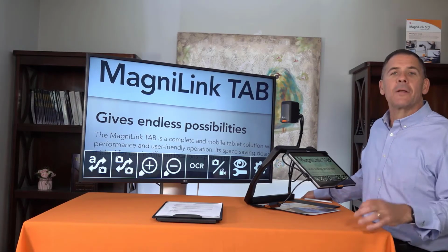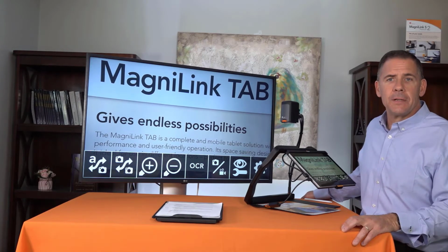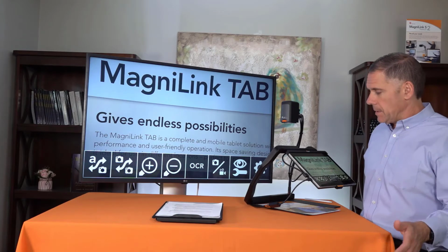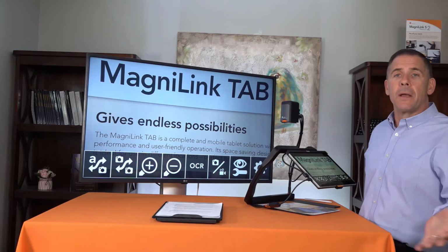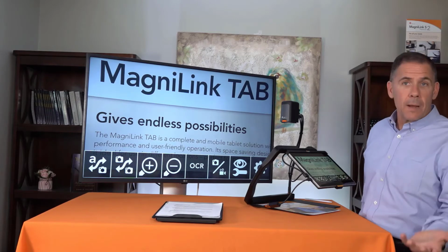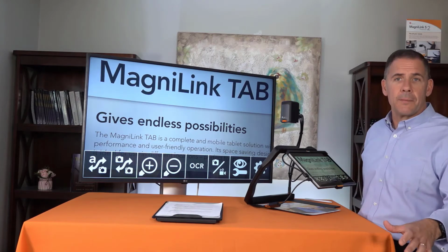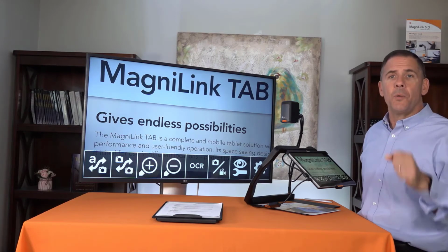In this video we're going to talk about Tab 2.0, the new software release that we just released a couple weeks ago. So if you're here in this video, you probably own a Tab, you just updated it, or you own it and you want to see whether you want to update it, which of course you would. This is not a full-blown demonstration on the Tab. This is just what's new with 2.0.